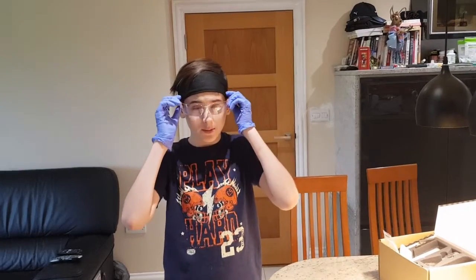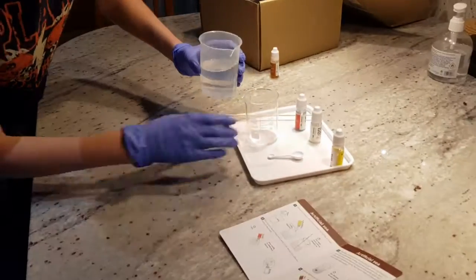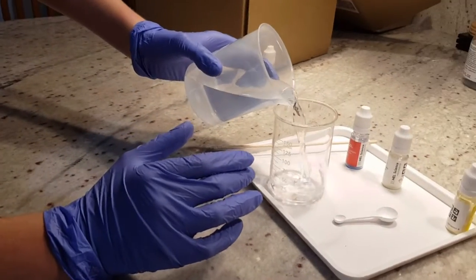Today I'm going to be growing chemical seaweed. The very first step is I've got to pour 100 millilitres inside this glass beaker.